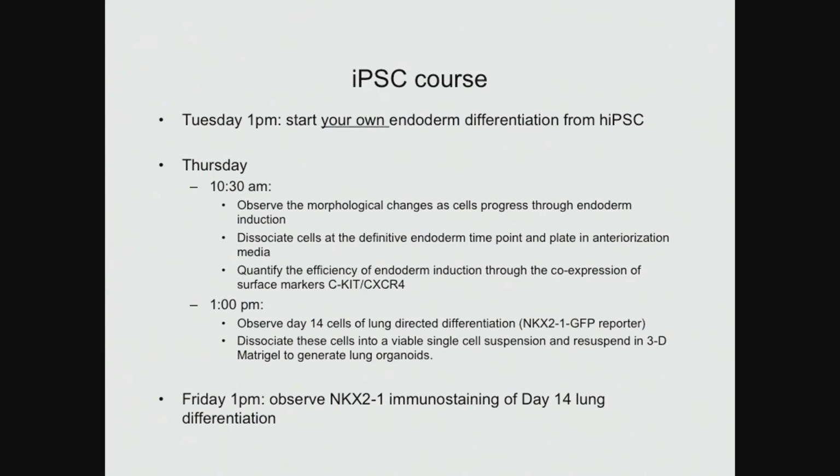That's the first part, and then at 1 p.m. you're going to see some cells that are, here's one I prepared earlier, coming out of the oven, and these cells will actually be day 14 of the lung differentiation. They're going to look very different. They are very different. In our lung differentiation protocol at this point, they're expressing some of the very early key lung markers.